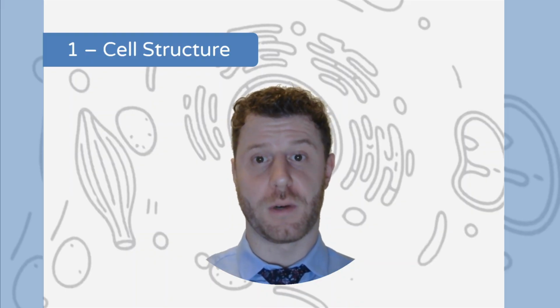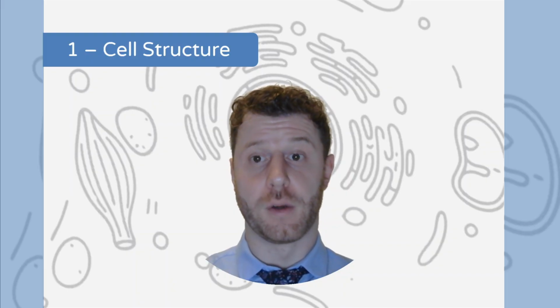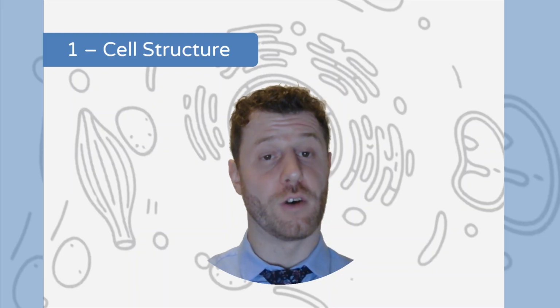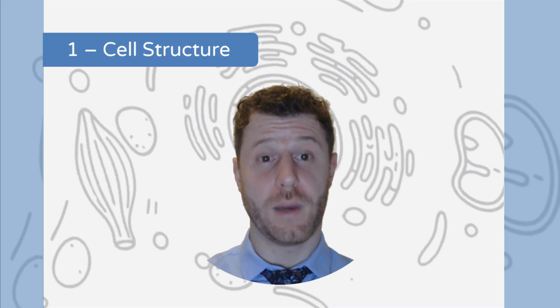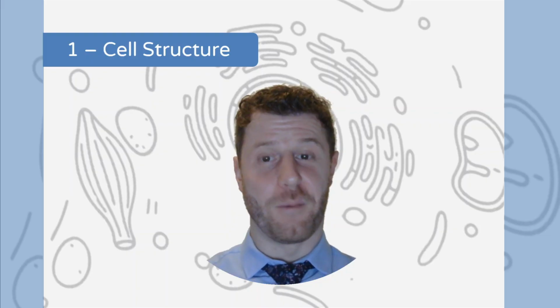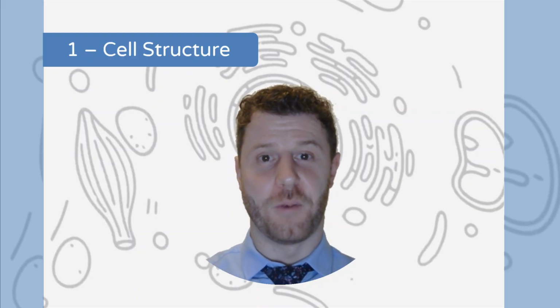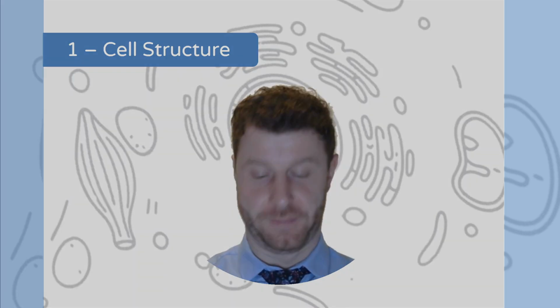I do videos on whole topics, or as big a topic as I possibly can, for the Cambridge Biology, and this is an A-level video. It's particularly focused on the microscopes practical section of Unit 1. There is another video which has got all of the content for that topic, but for this video I'm going to try to teach you how to use a microscope for practical paper 3 without actually having a microscope in front of you. So let's get started.